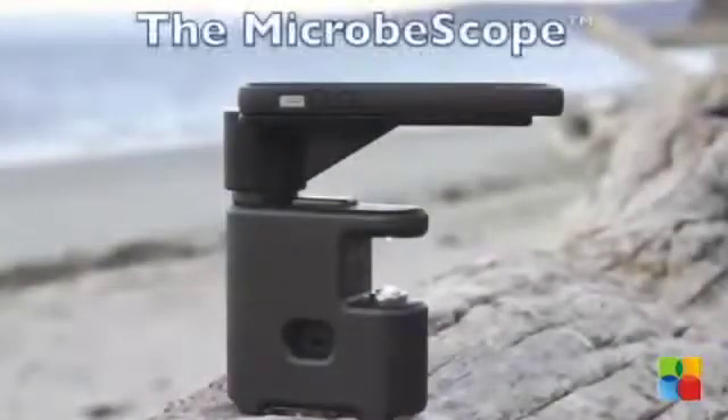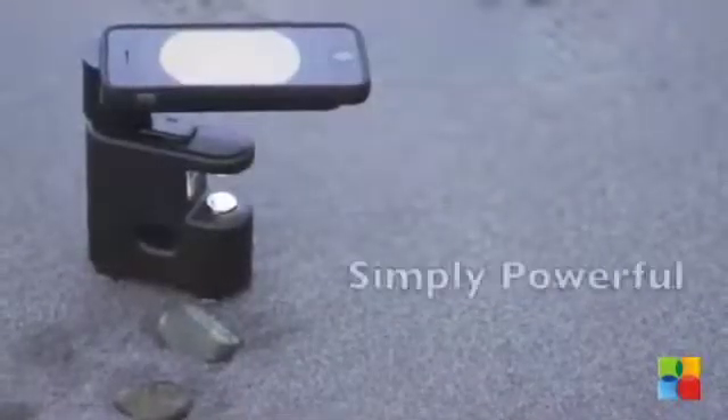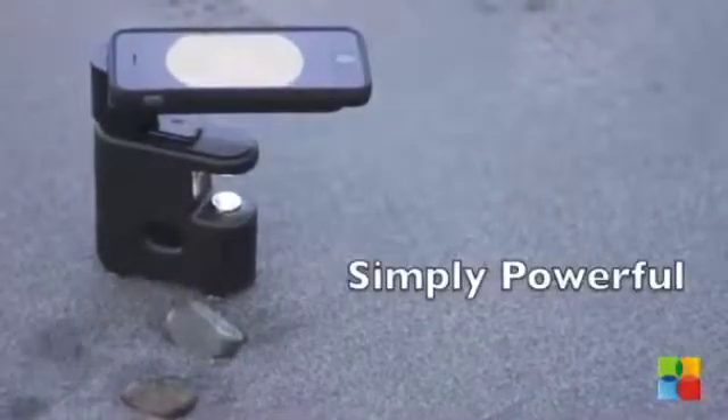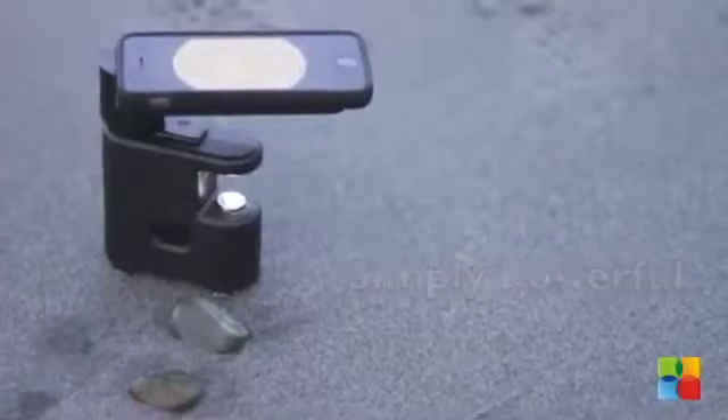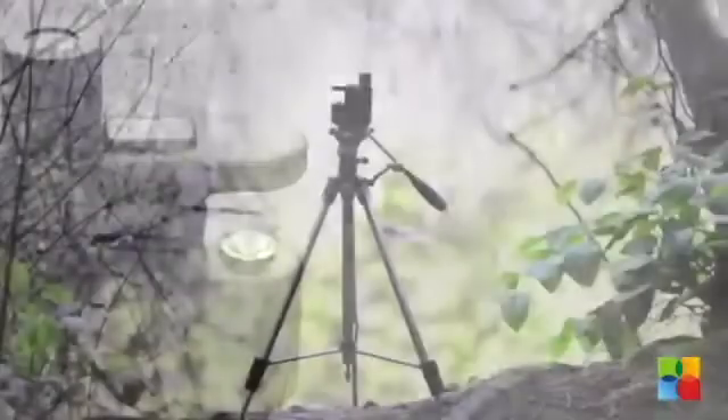The Microbe Scope is a pocket-sized microscope that reveals microbes and shares video via iPhone compatibility. It houses a powerful fixed-focus instrument which is capable of viewing micron-sized particles. It works great in the field, lab, or even at home.